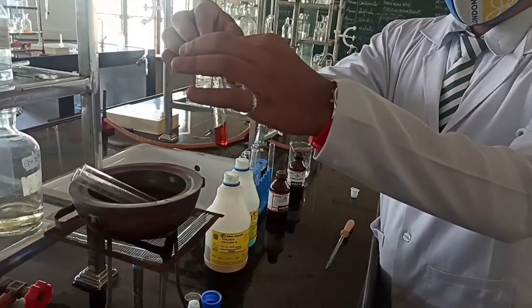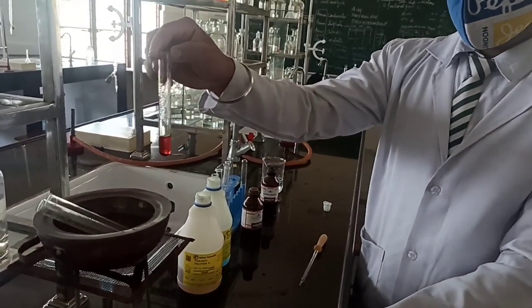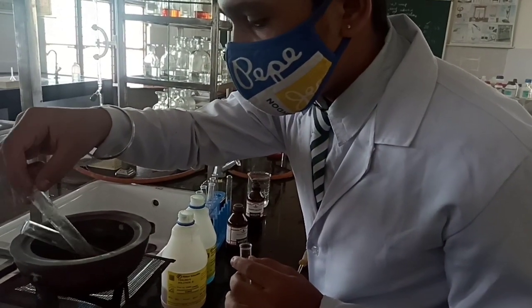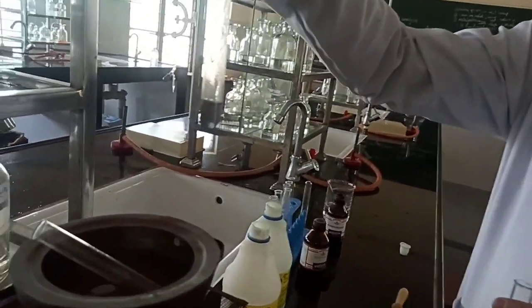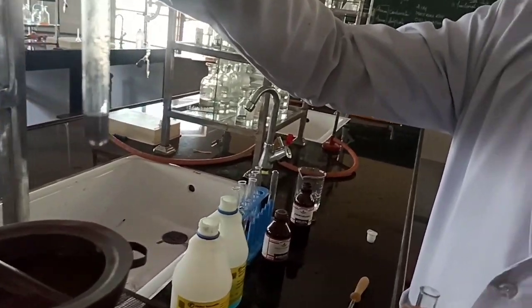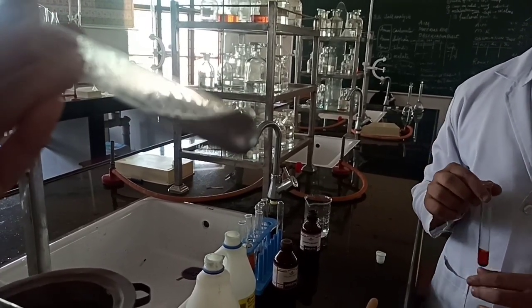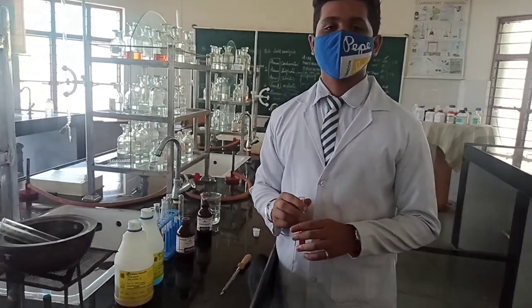We can now see the appearance of red color in the Fehling's test. And checking the silver mirror test — the second test tube — you can see the sides of the test tube where the silver has precipitated, showing a silvery appearance on the bottom side of the test tube. We are done with the testing of aldehyde.